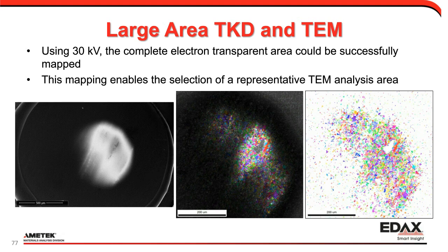This is important because for non-cubic materials, knowing which grains are going to have the correct diffraction conditions for imaging different defects can be important. So we can see a wide range of grain orientations with transmission EBSD to help guide TEM work on a sample. So it can be a much more efficient TEM specimen analysis time.